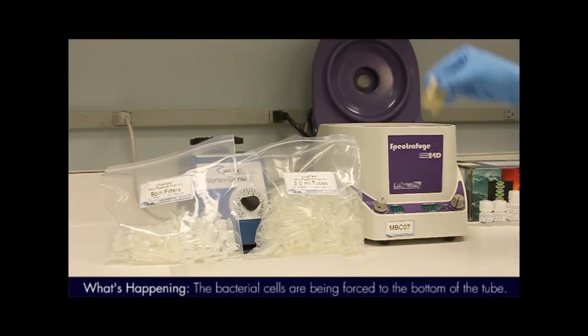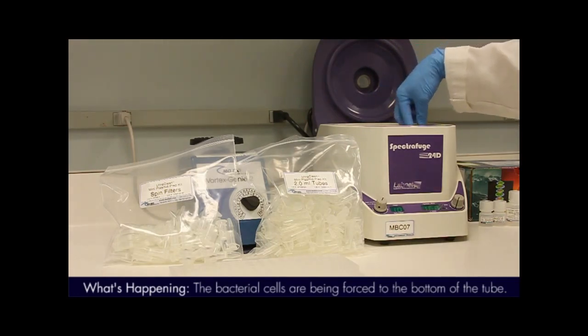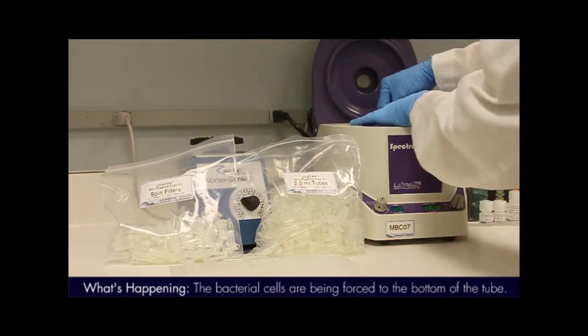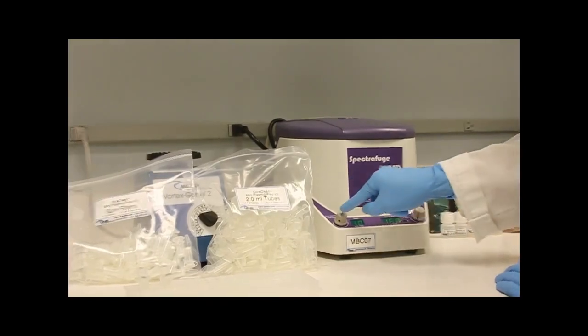Each plasmid prep will require a set of two 2 mL collection tubes and one spin filter unit. Add a maximum of 2 mLs of culture to the first tube in each set and centrifuge at 16,000 times G for one minute.